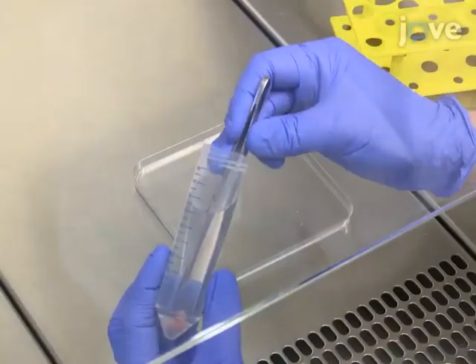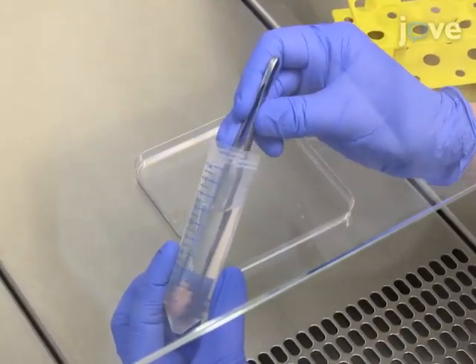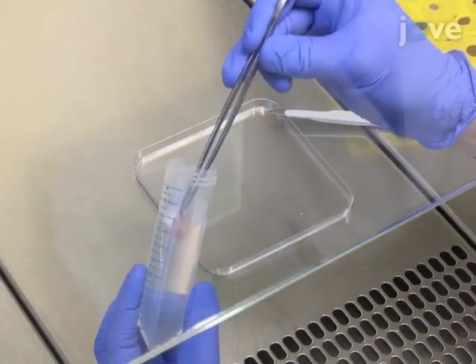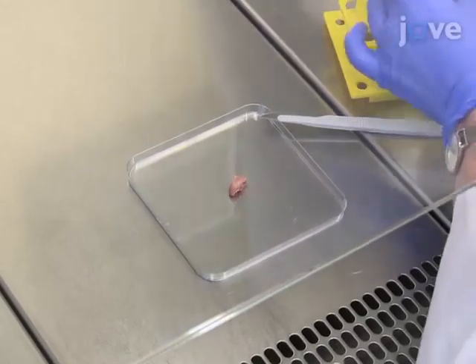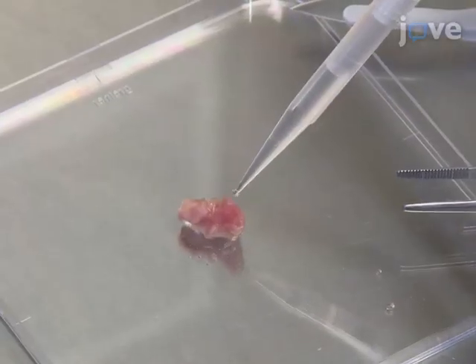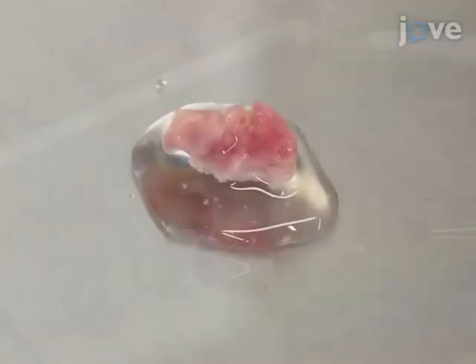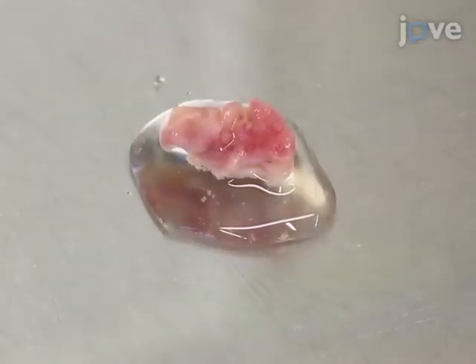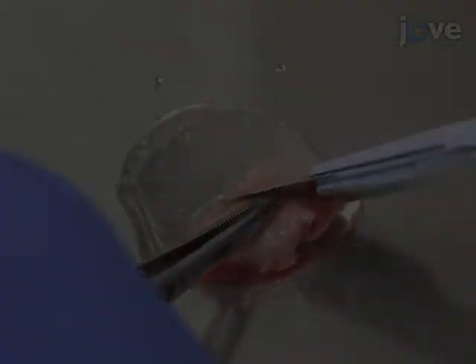To remove all the fat, non-tumorous tissue, or potentially necrotic tissue parts, use sterile forceps and transfer the tissue pieces to a sterile cell culture petri dish. Then add three to five milliliters of antibiotic-supplemented HBSS buffer to leave the tissue pieces moistened. Next, use a fresh scalpel to trim the tissue.